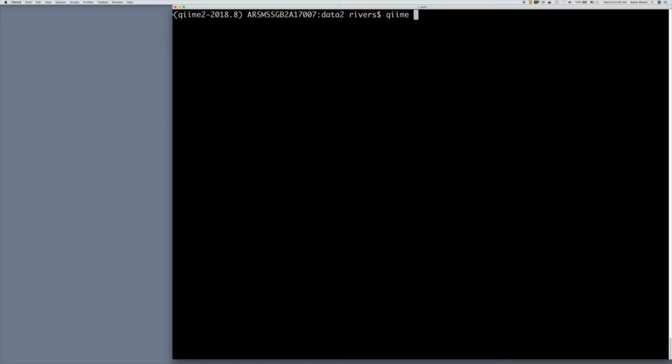The software is pretty fast. Because of the clustering step, it doesn't have to process nearly as many reads as ITSX did. In the ITS1 region, at 99.5% identity, it's about 14 times faster, and in the ITS2 region, about 23 times faster. At 100% clustering, it's still faster, 6 to 9 times faster in that case. And the results are fairly comparable because the same HMM models are used as in ITSX. We'll use ITS Express to trim the reads.